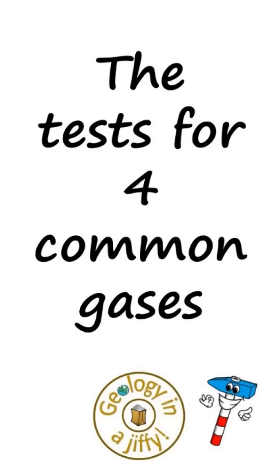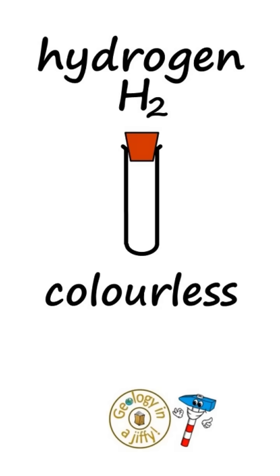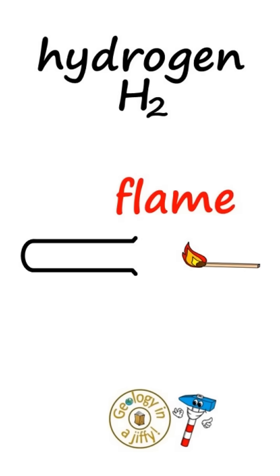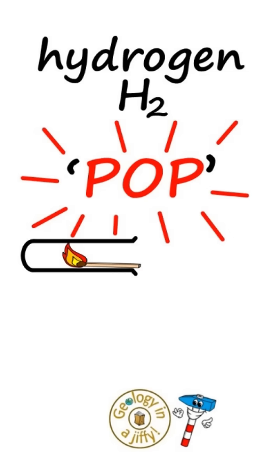The tests for four common gases. Hydrogen looks like this, colourless and odourless. Take a tube of hydrogen, take a flame, put it in the gas and if it's hydrogen it will squeaky pop.